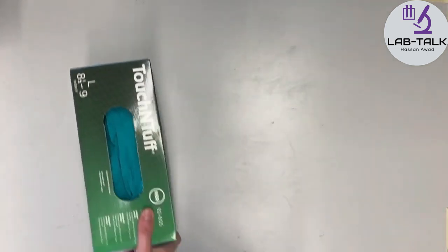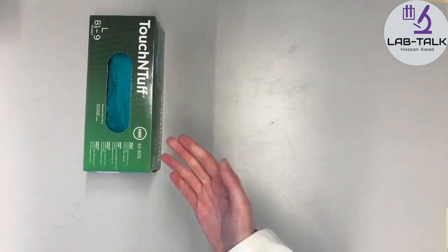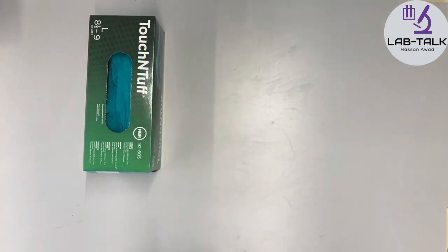To work with gloves, you will need gloves. For me, this is size L. But for other people, you might need size S, size M, or size XL. Always test which feels comfortable for you.